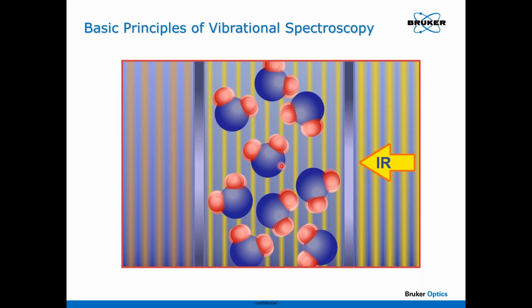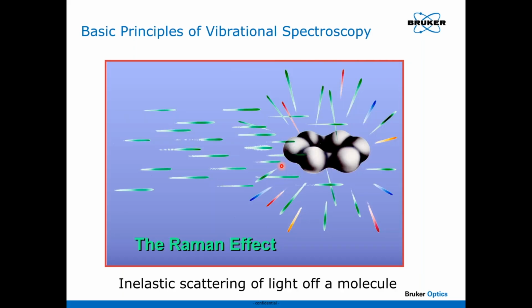Beer's law only works if all the molecules in question have a fair chance, so to speak, at the incident light. So we need to make sure the sample is optically thin. For attenuated total reflectance, or ATR, that works great because the depth of penetration in ATR is typically only 2 microns. So ATR works the best, and transmission if the sample is thin.